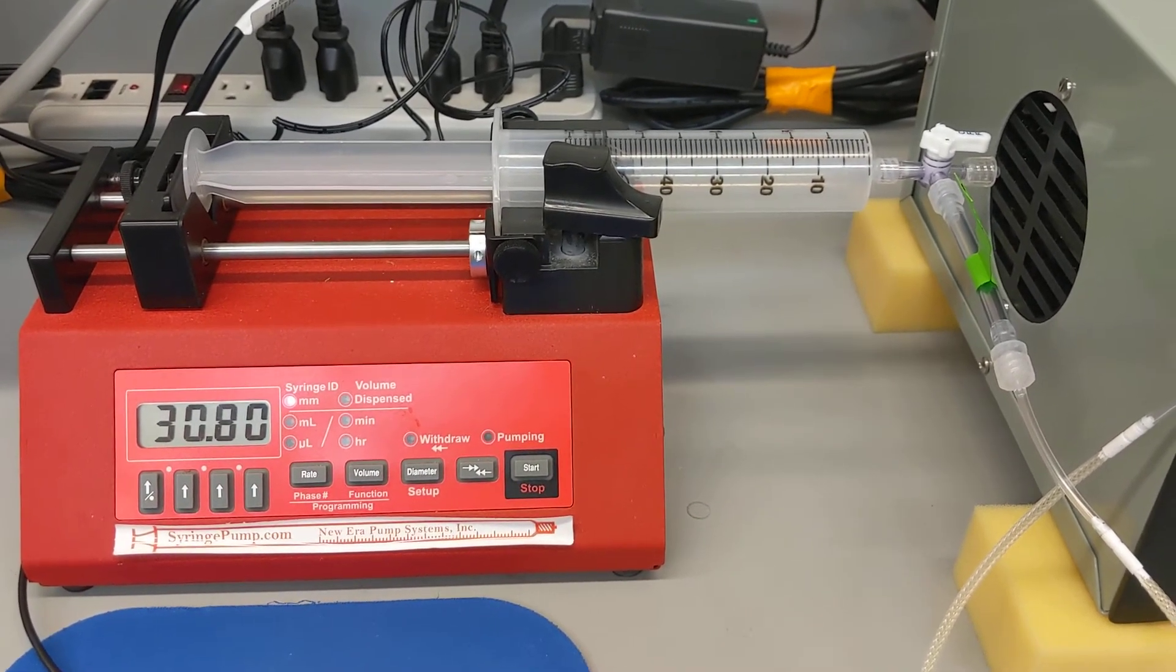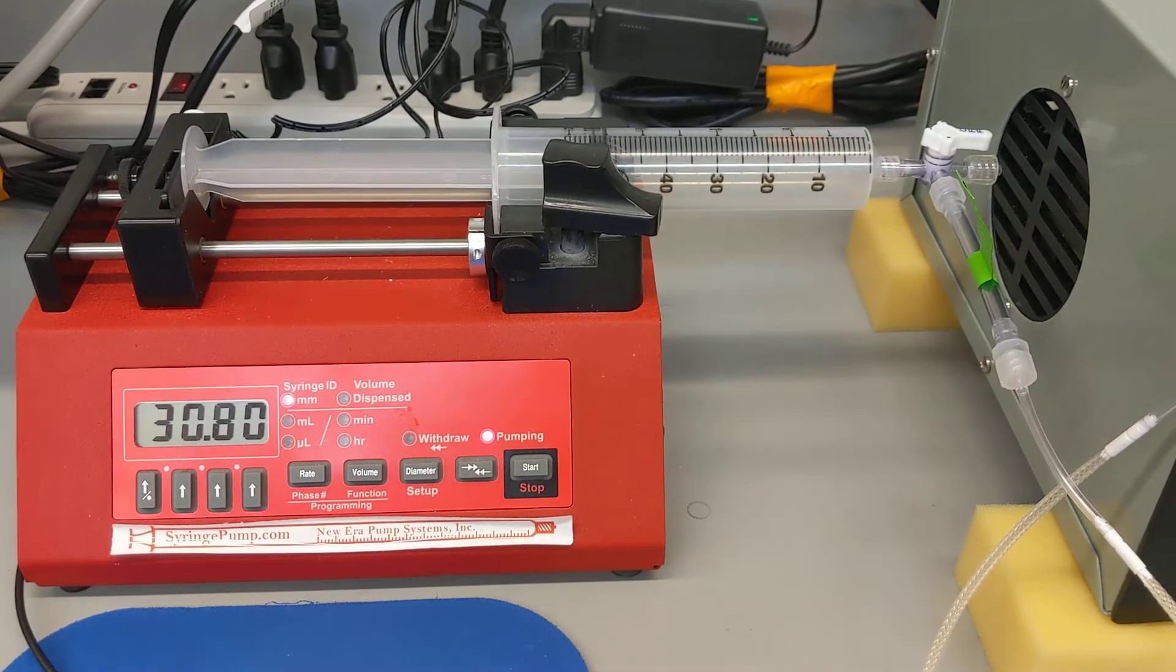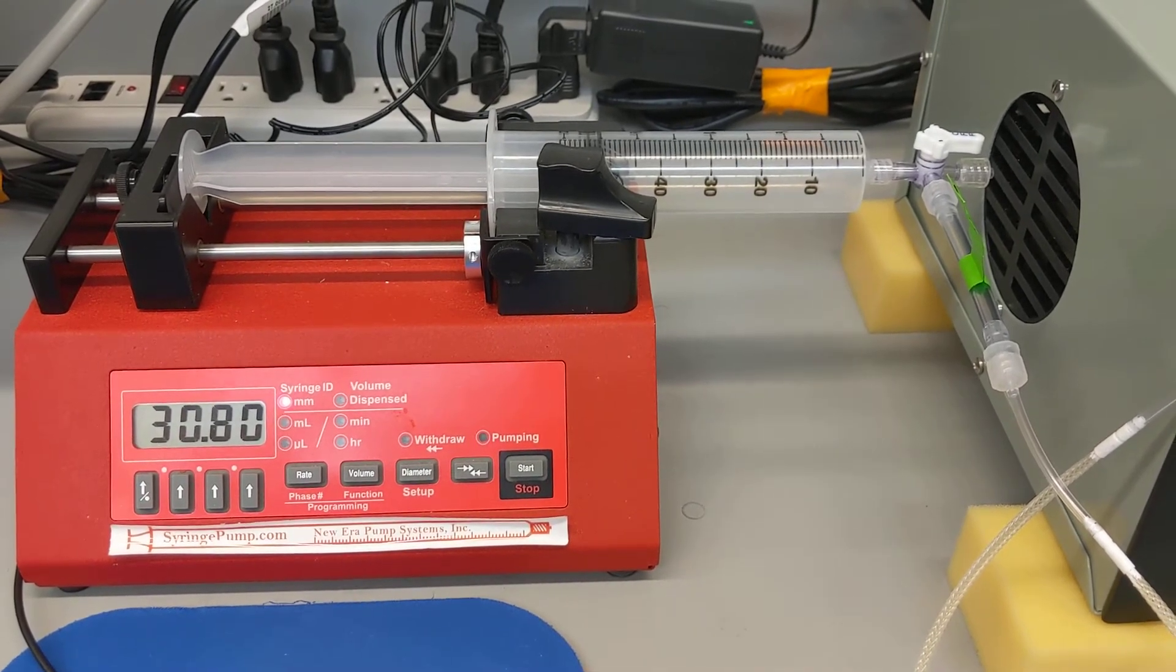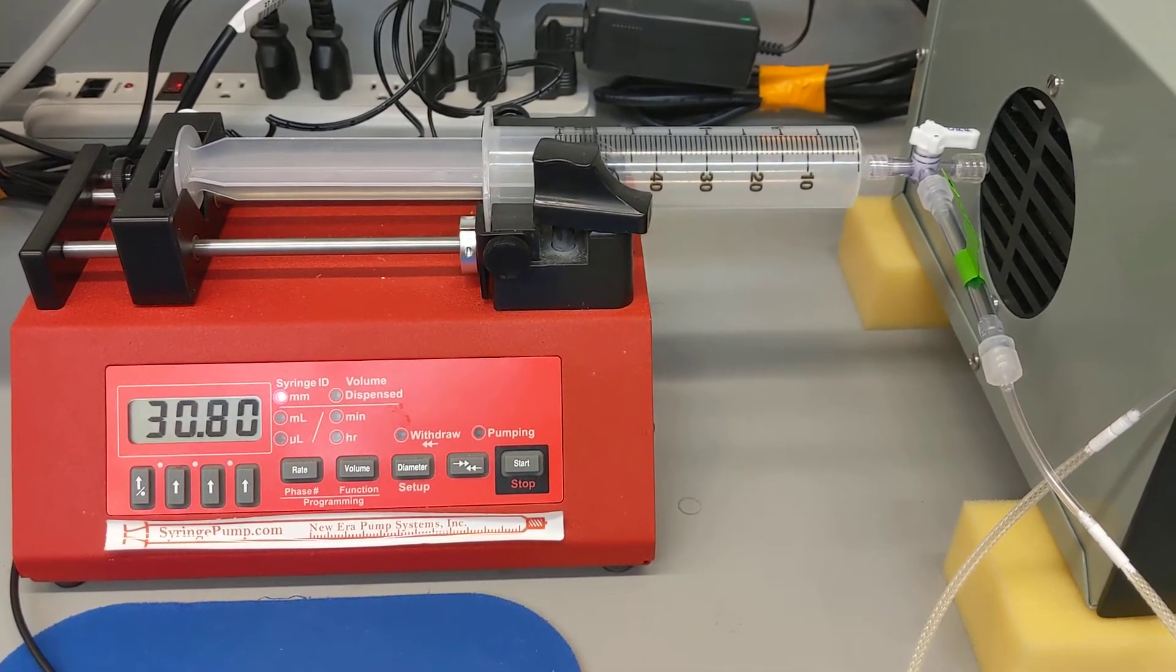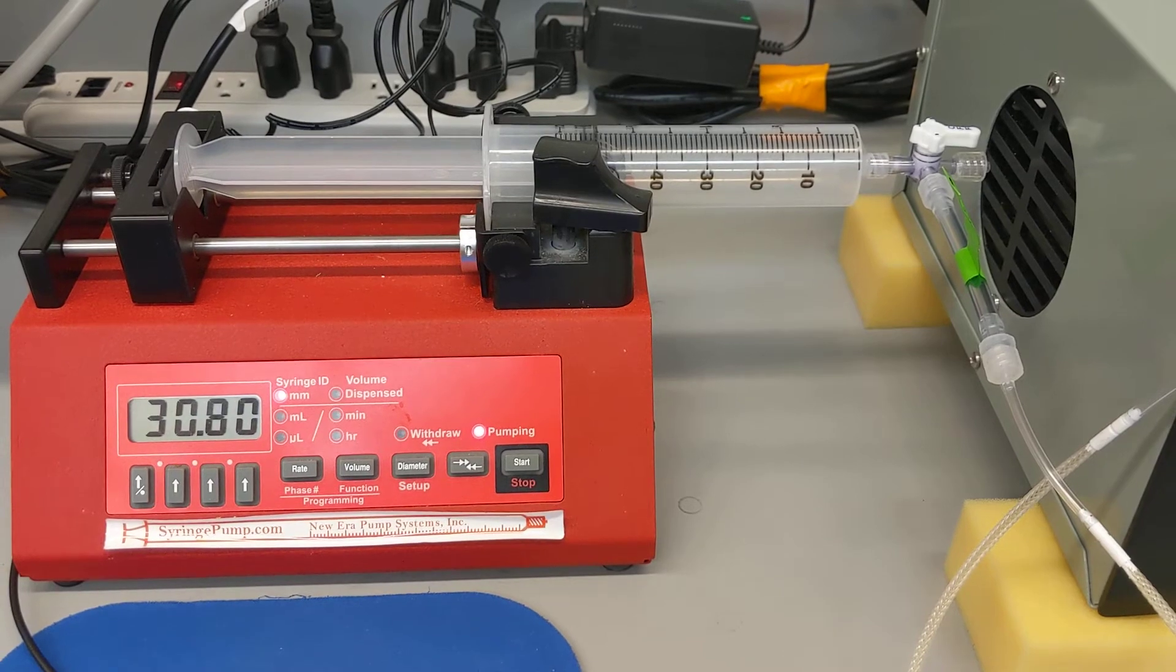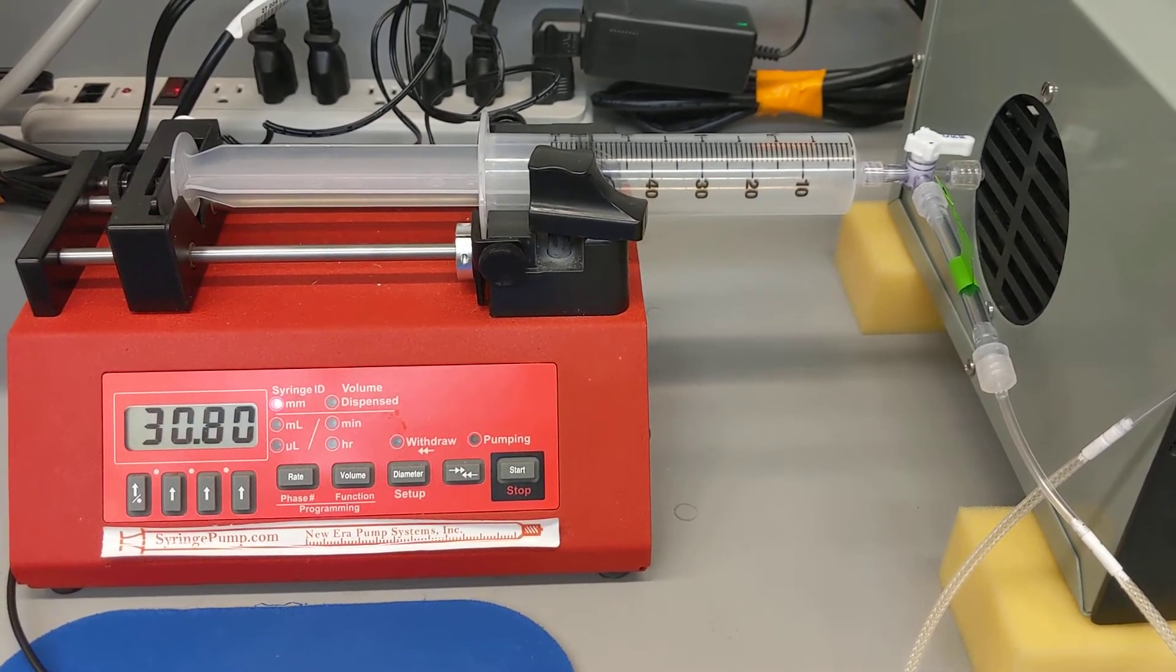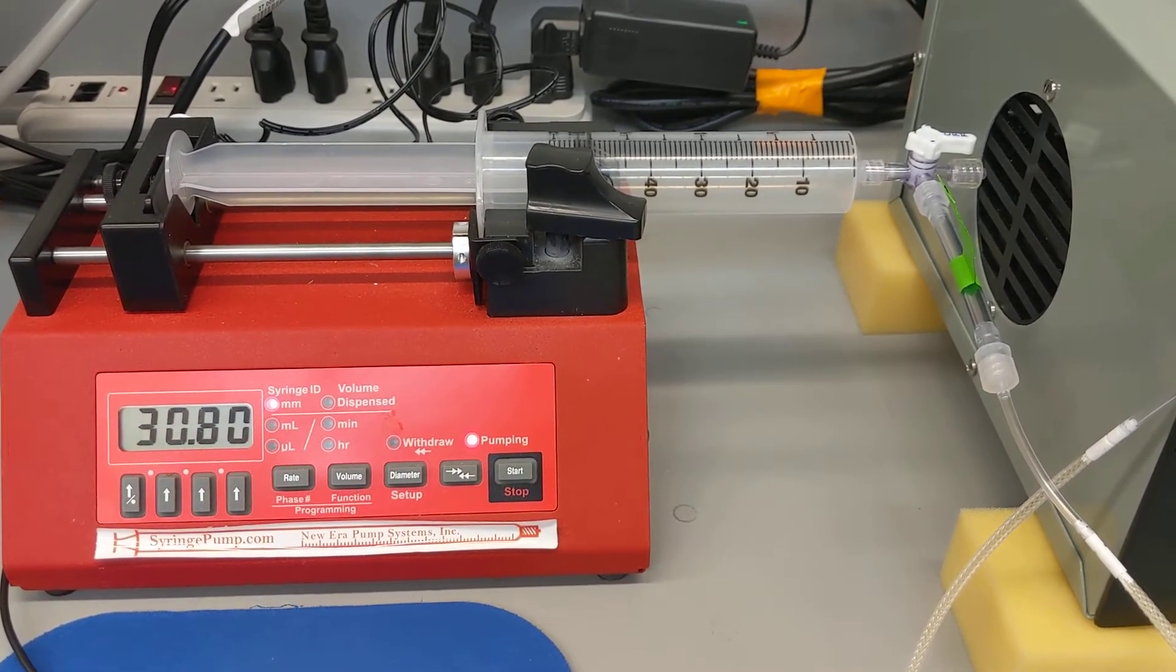So this syringe pump allows us to pump through at a very specific rate that we could measure and then build that into our calculations and look at the percentage of oxygen in there.